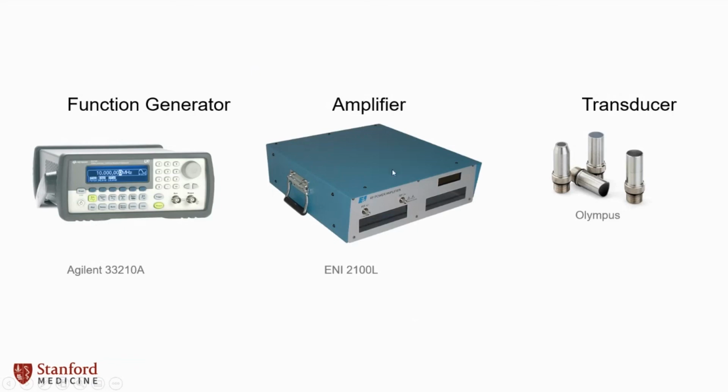Power amplifiers, brand new, these things are pretty expensive. I think brand new, like this particular ENI 2100L, this is a kind of amplifier that will give you the power you need without knowing anything about your ultrasound transducer. This can cost like 20K brand new. I've bought old ones from like the 70s that work fine. These things were built to last. Those cost like 2K, a little cheaper.